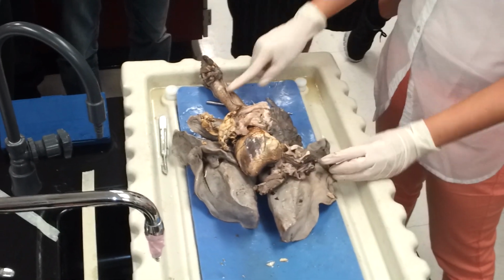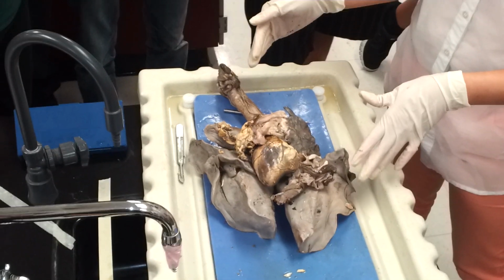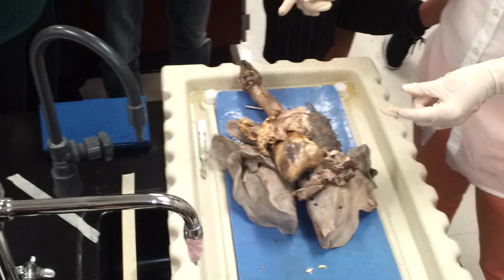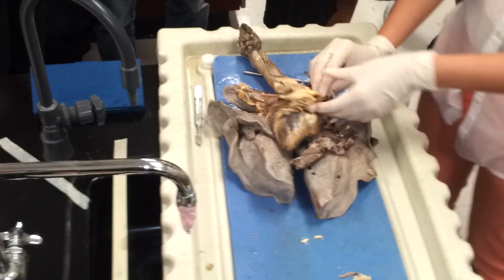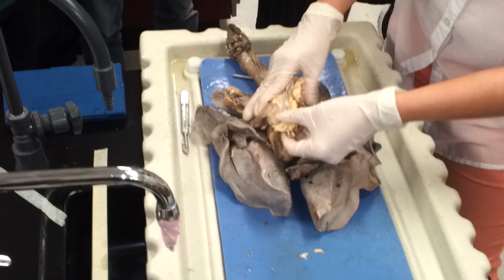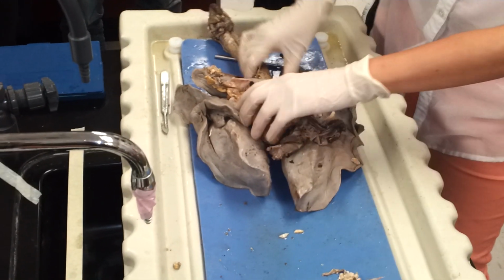Okay. Just imagine, what's the area in between the two lungs? It starts with an M. Mediastinum. Good. So the mediastinum houses the pericardium, which wraps around the heart. Remember, we couldn't see the pericardium before, but now we can. So this is a tough tissue, kind of, that wraps around the heart, and it's been kind of cut. Okay, so if we take off the pericardium, we can see the heart.